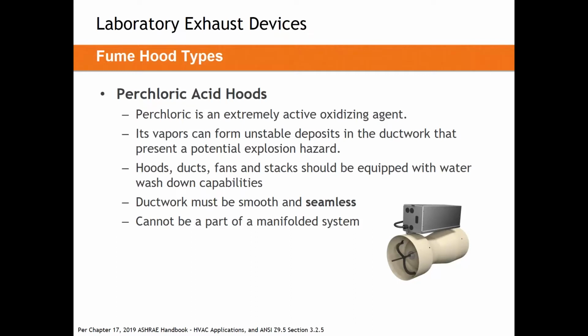It's used in a lot of different chemical reactions. And what can happen is when perchloric acid dries, essentially, the vapors can form an unstable deposit in the ductwork. It forms what's called perchlorate. Perchlorate is extremely explosive. So unfortunately, in the past, there have been instances where perchlorate has exploded, it has harmed humans, it has unfortunately killed people.